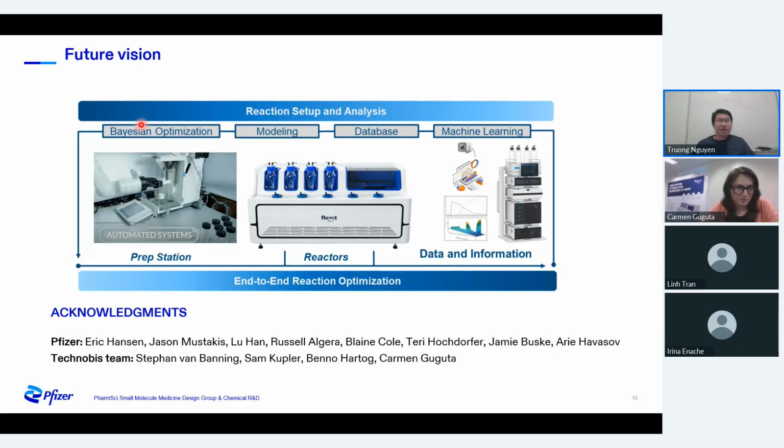If you're looking for isolation and a larger amount of your product, probably not. But in terms of generated data, if you have representative data, it will be the same whether you run in the ReactALL or the EasyMax. So if we can get the same result, why not use something that uses less material?